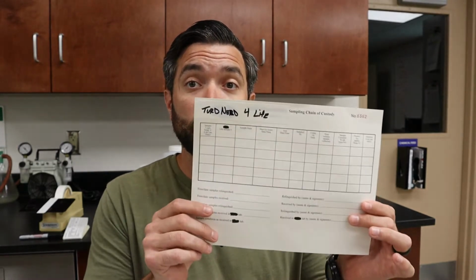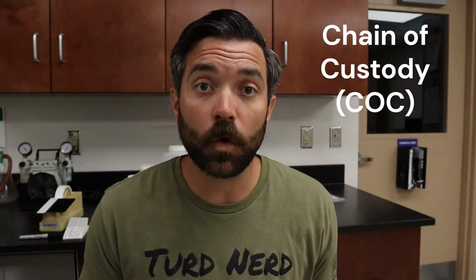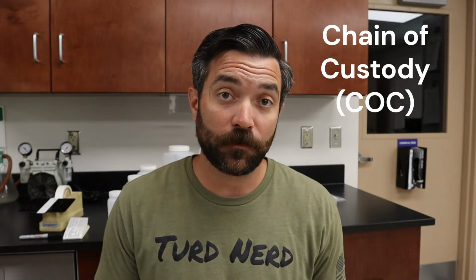Next thing we want to talk about before we get to the bottles is the paperwork. There's two forms of paperwork you need to be familiar with. Number one, and most important, you will more than likely see a test question about this in your career of test taking, whether that's lower operators exams or even your lab analyst exam. It's going to be your chain of custody, or COC, commonly referred to.